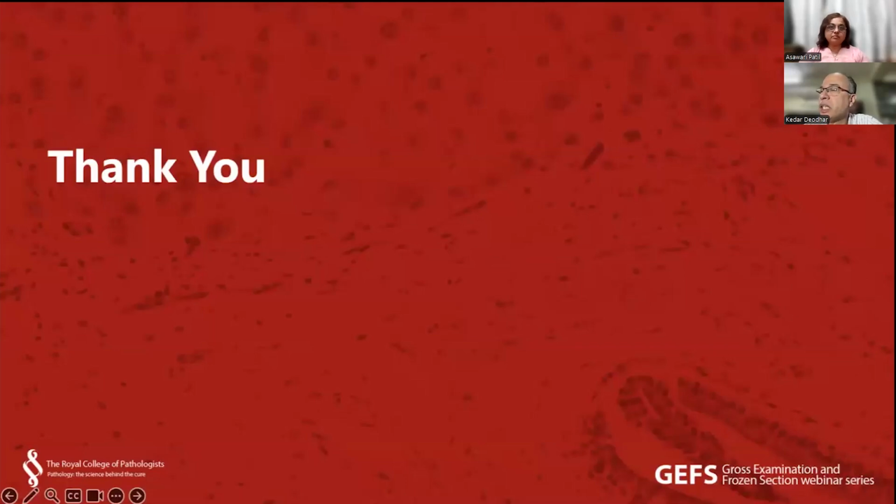Okay. The next question is: if you have a large specimen and you are taking a shave margin, sampling the entire margin is going to generate a lot of blocks and slides. So do you take only a representative shave margin, or what do you recommend? That's a good question, because shave margins are not really submitted entirely. As I said, it is mainly for mucocutaneous margins, which are usually only two margins. Or it could be for bony cut margins, which are again limited. For mandible there could be 1 to 3, maxilla there could be 1 to 3. Or for laryngectomy, it is the inferior tracheal margin. For the rest of the margins, especially for mucosa and soft tissue, it is always a radial margin. So if it is radial, it is always representative.